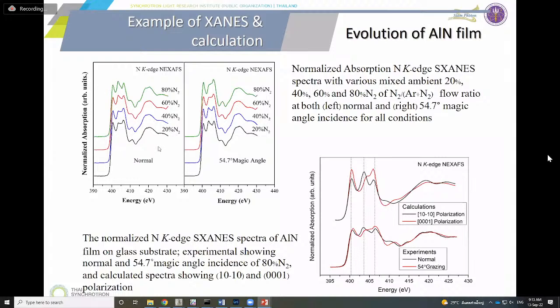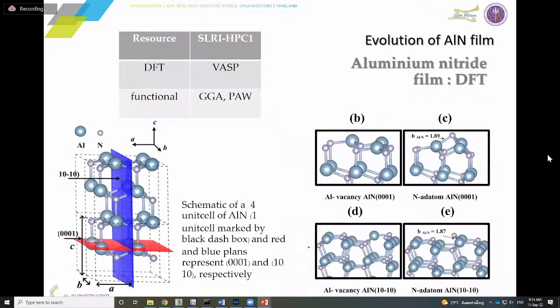We get the spectrum, and if you tilt the sample a little bit and rotate it, you can see the features of the spectrum change. That means the synchrotron radiation detects some structure in the horizontal direction more than the vertical direction. And by this information, to sum up, we have different directions of structure growing on the surface.